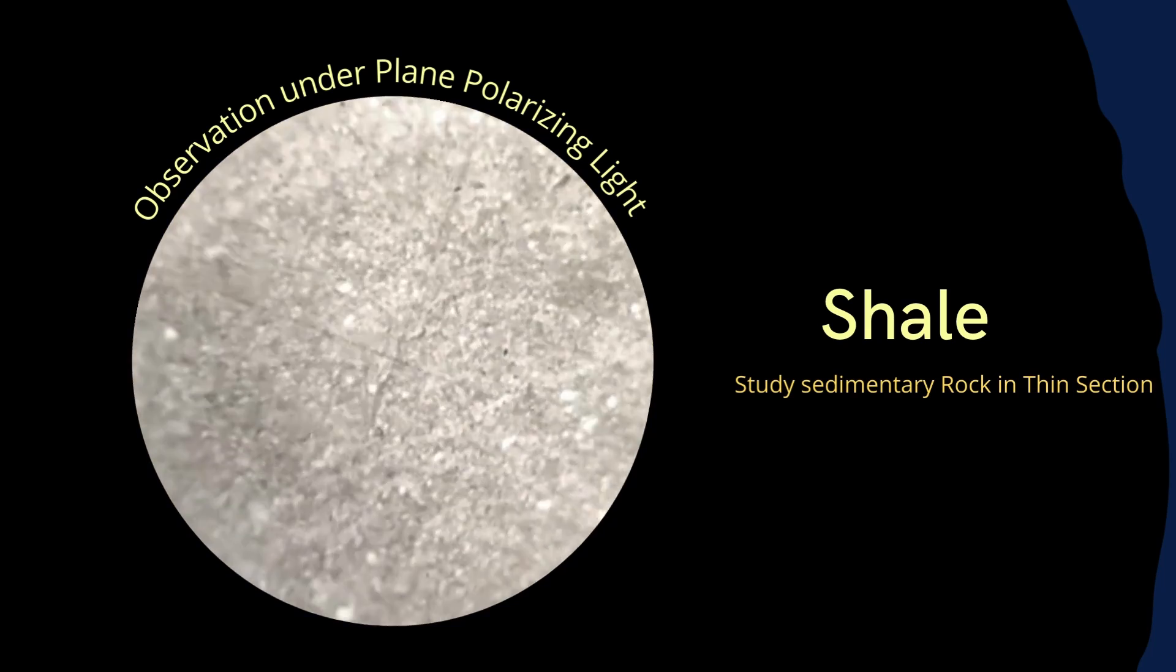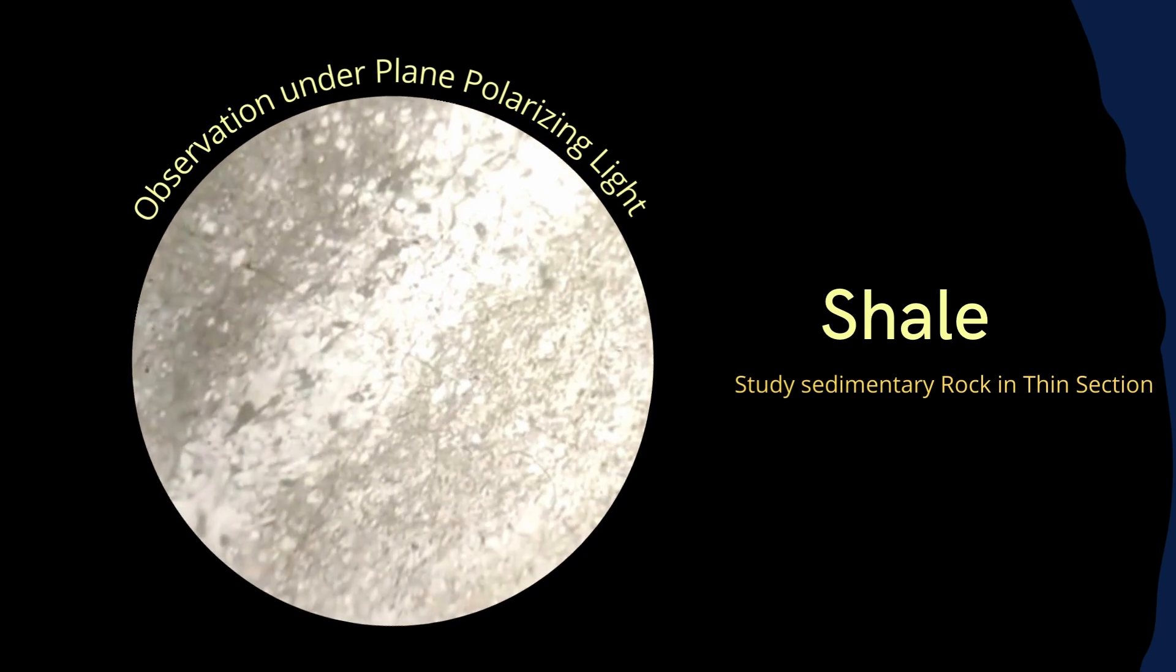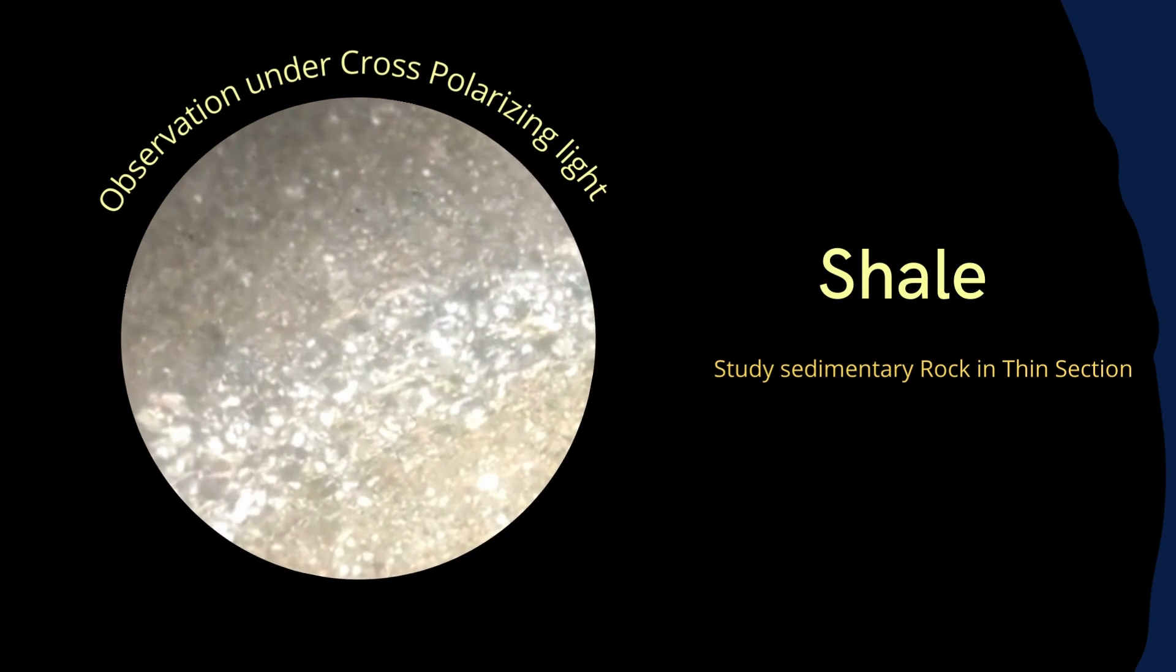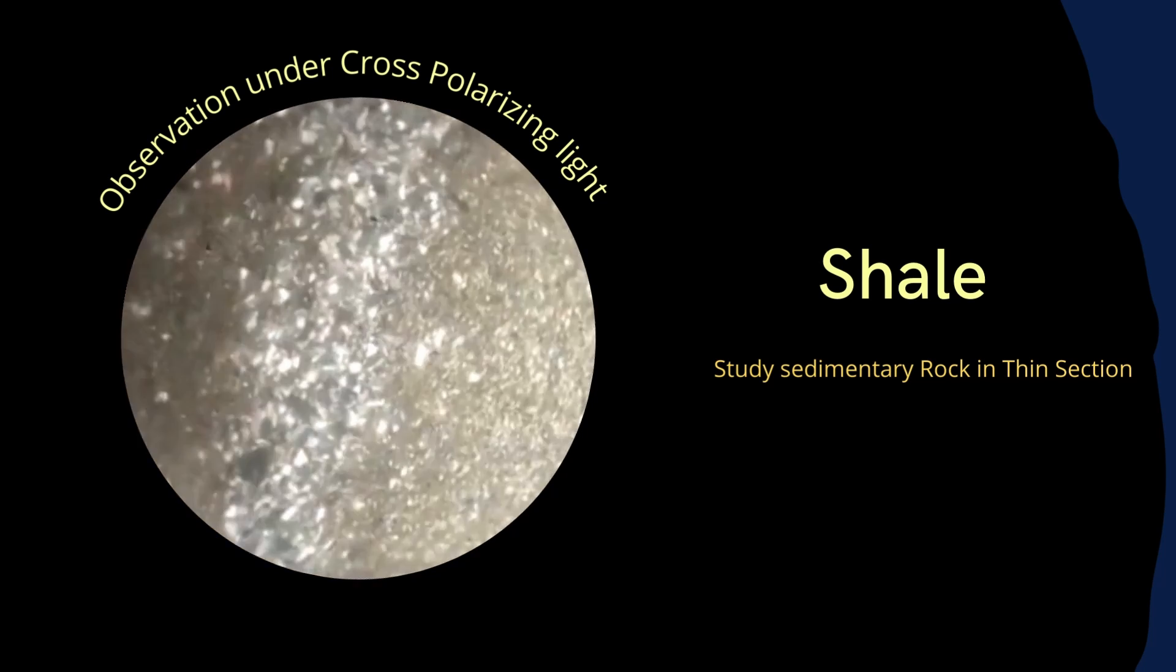Now let's look at the thin section of shale under the plain polarized light again and observe its properties, minerals, texture and structure. Here is the clear view of shale thin section under crossed polars.